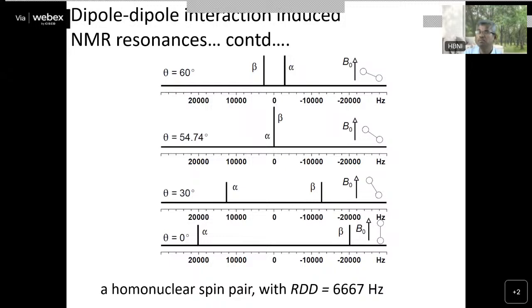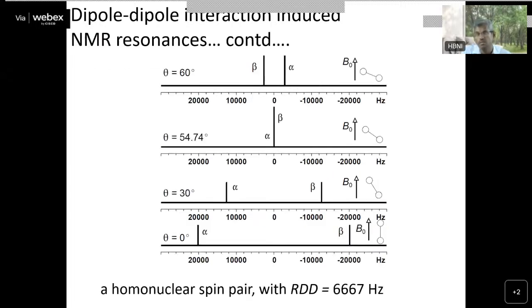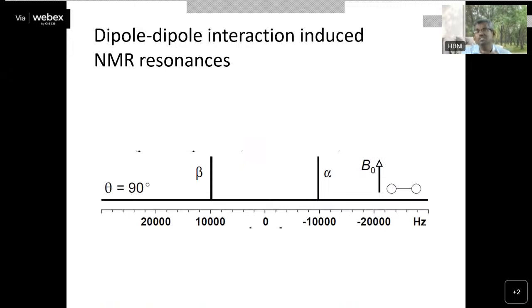So this is a typical example of a calcium sulfate single crystal in which the water molecules are isolated, and there is no inter-water molecular interaction. Only the intra-proton interaction is taking place. If you see any textbook, you can see this, because this is a very common thing, also on Google. You can get the most common thing about this solid state NMR pattern. First, in the beginning, what they introduced is the proton NMR of calcium sulfate dihydrate.